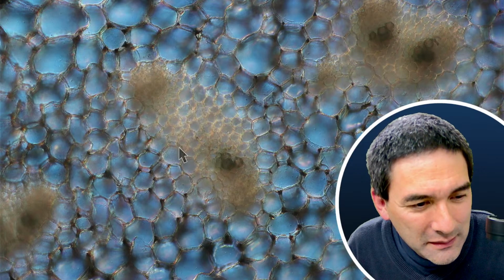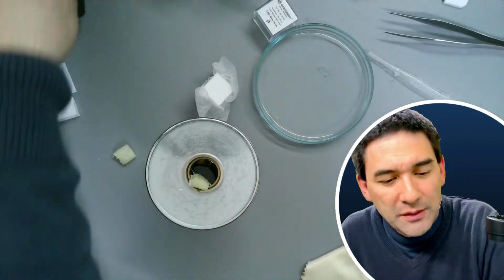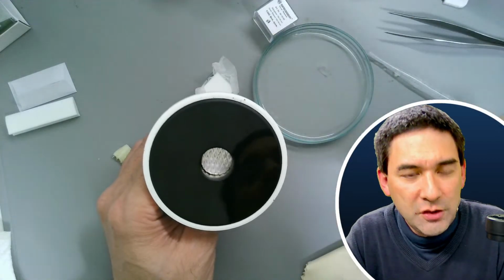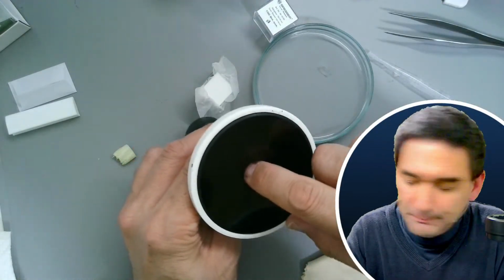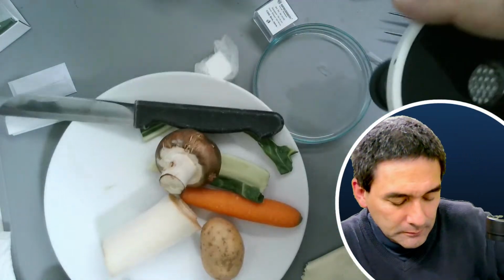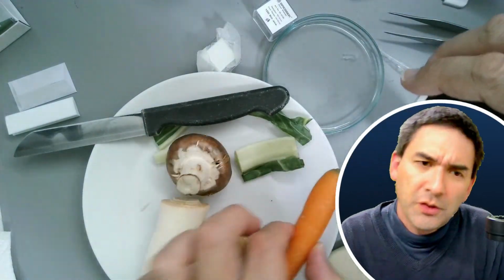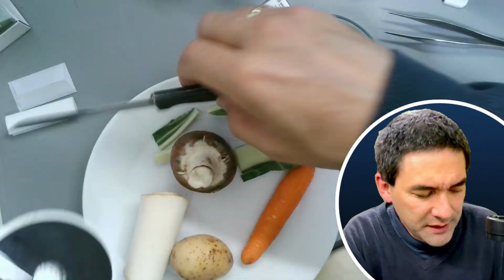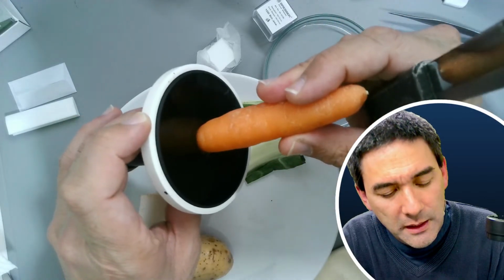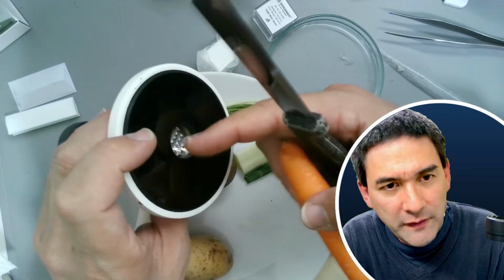So let's go back to the desk view, and what I could do now is try to cut a carrot using this one over here, with all of its advantages and disadvantages, because there is no clamp. Maybe either a carrot or a potato, or maybe the mushroom. Mushrooms are, I think, not so interesting, but we're also able to see the cells here. So let's try this. Because there is no clamp, I have to somehow make sure that the side of the microtome provides stability.